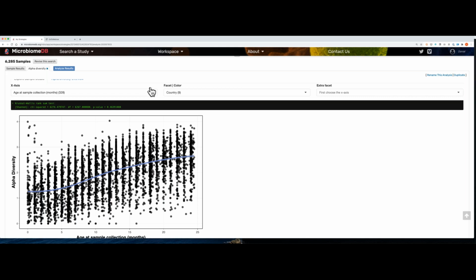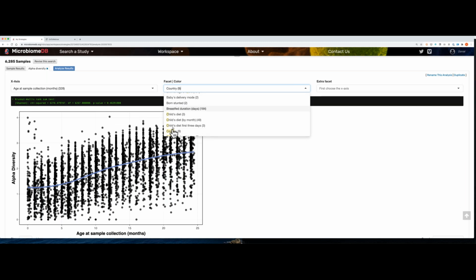One thing to point out to everybody on the call is that you're passing a lot of data basically from the database into these visual graphs that you're seeing on the page, and it's not summarizing the points, it's actually loading all the points. Is that correct? That's right, and it's calculating, in this case, alpha diversity for all these data, and then it's partitioning them based on what we've asked it to.